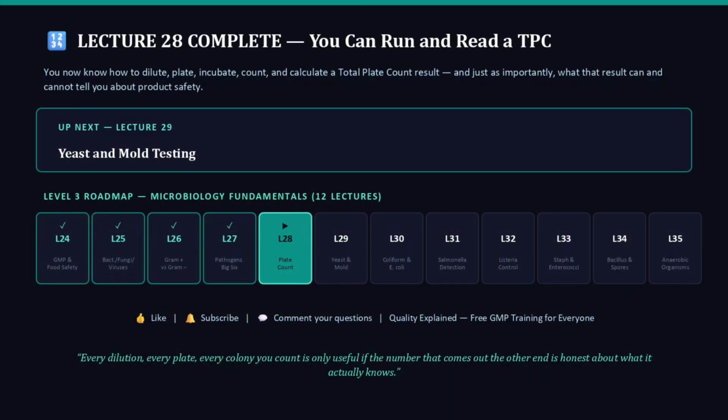That is Lecture 28 complete. You can now run and read a total plate count. You know how to dilute, plate, incubate, count, and calculate a TPC result from start to finish, and just as importantly, you know exactly what that result can and cannot tell you about product safety. Up next is Lecture 29, Yeast and Mold Testing. That lecture applies almost this exact same quantitative framework, dilution, plating, counting, calculation, to fungi instead of bacteria, with a few important differences we will walk through.